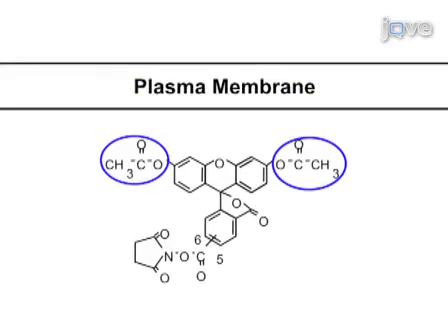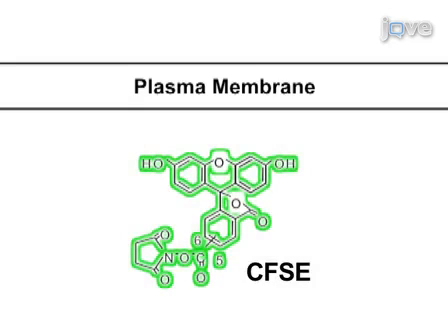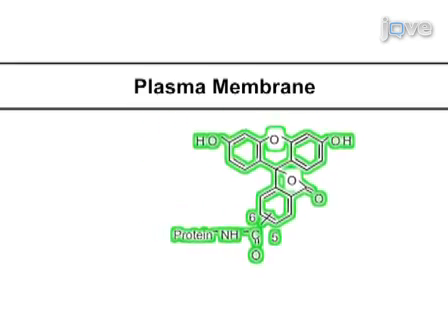The two acetyl groups allow the dye to rapidly enter cells. Within lymphocytes, esterases remove the acetyl groups from the CFDA-SE, forming the CFSE form of the dye. Without the acetyl groups, CFSE becomes fluorescent and is also less membrane permeant, thus concentrating the dye within cells. The aminoreactive succinimidyl side chain of CFSE then covalently couples the dye to intracellular proteins, thus making the cells almost permanently fluorescent.